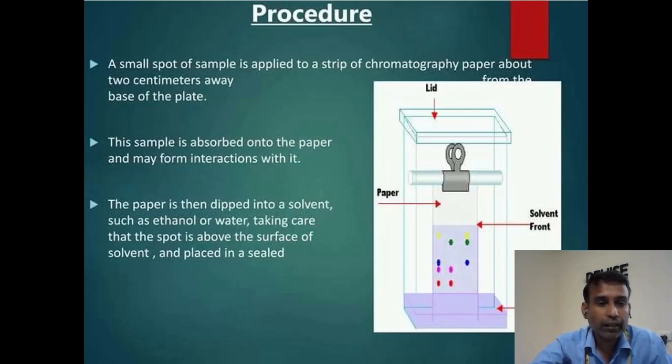So here we have to take care carefully. The bottom line should not touch the solvent medium directly. It will interact with the paper layer, then reach the base layer, then the spotted portion present at the bottom line, where we are spotting the 2 to 3 drops of extract material, and it will interact.